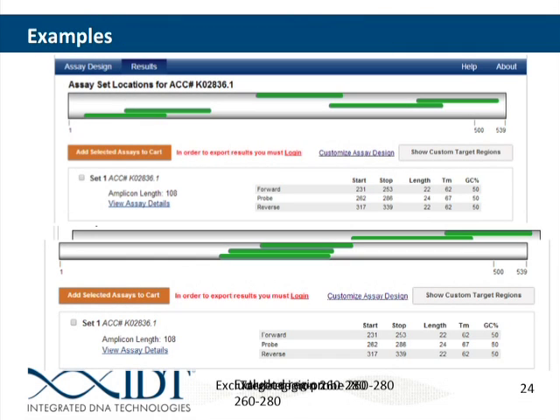And so here's an example where we're tailoring the assay to different regions. So here's the basic output when we just do the qPCR basic settings. Now if we set our excluded region to 260 to 280, you see that it's not putting any of the primers in that region, but our probe is still located in that region.